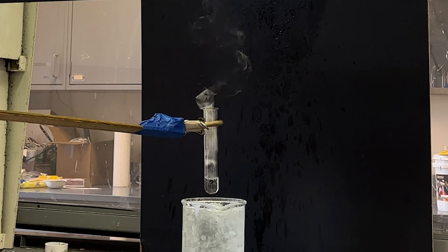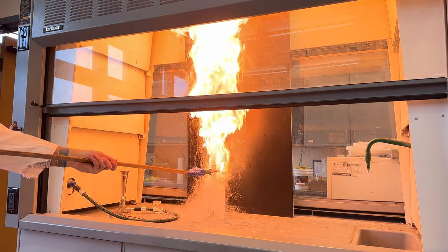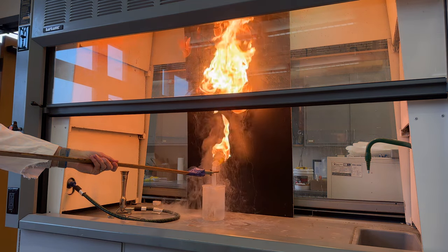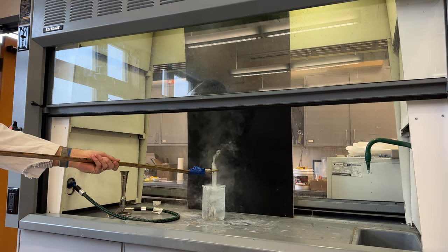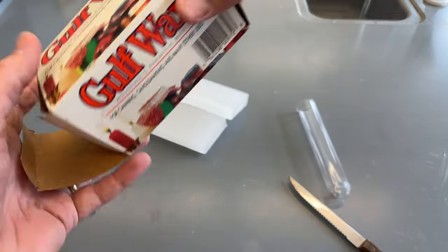Here it is again in slow motion. The heat from that fireball was intense, so what exactly is going on here that caused that to happen?